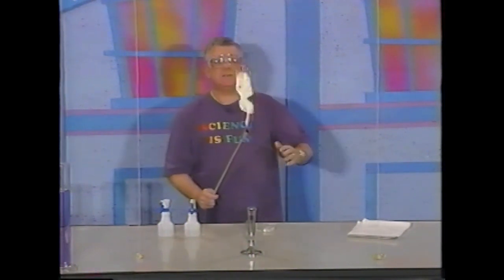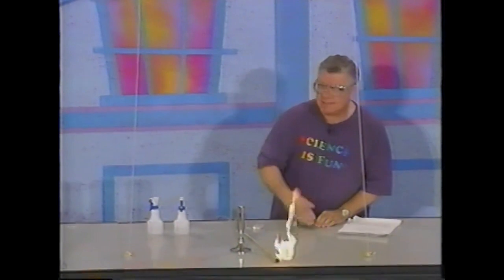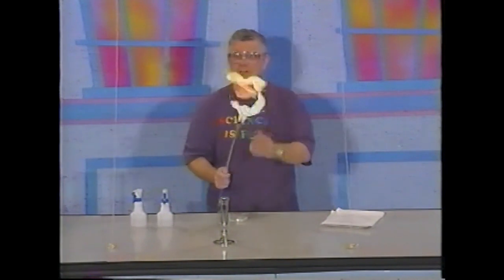Now, what do you suppose we have in those balloons that are up in the air? Helium. Some are saying helium. You say helium because you know from experience that helium-filled balloons are lighter than air. Other people said hydrogen, and hydrogen is a gas also lighter than air. I will tell you that helium is a gas that does not burn. So one way to find out what's in those balloons is to put the flame to them.